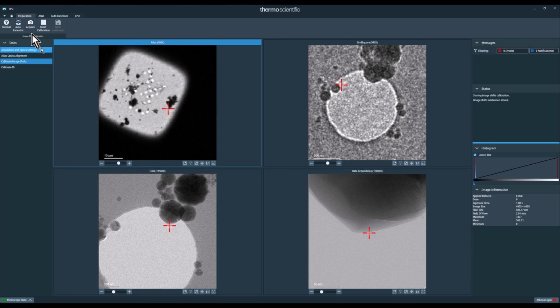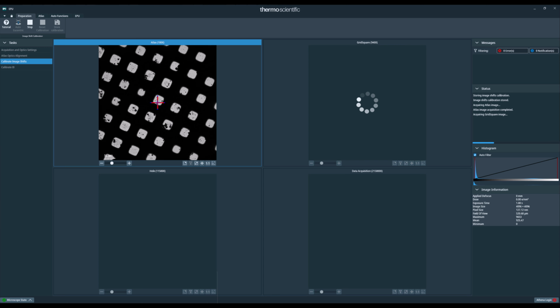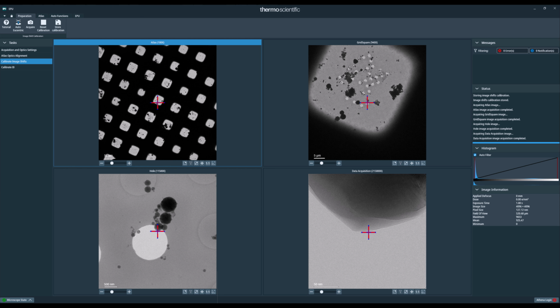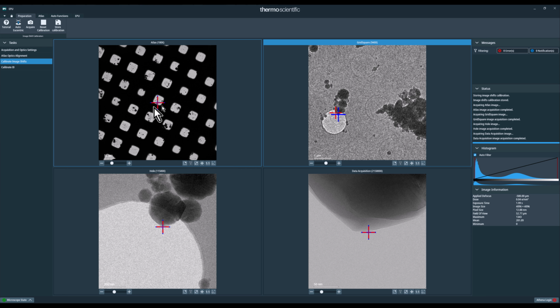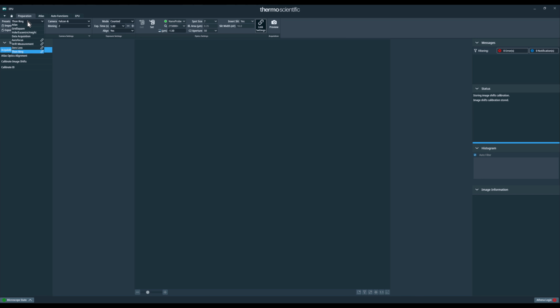To redo the calibration, simply click Acquire. Keep in mind that the stage is not perfectly accurate, which means that a very small offset may still exist at the highest magnification, but that's still acceptable. And again, recenter the feature in each preset. In the end, click Store. Go to Acquisition and Optics Settings, select Eucentric preset and take another image.